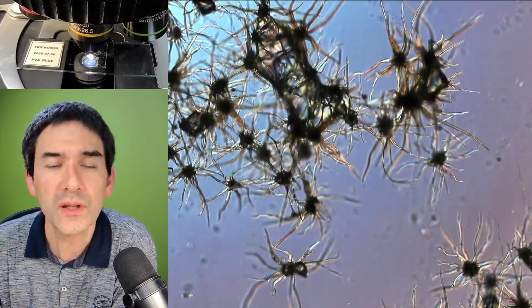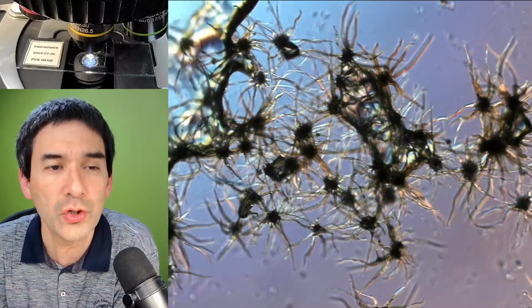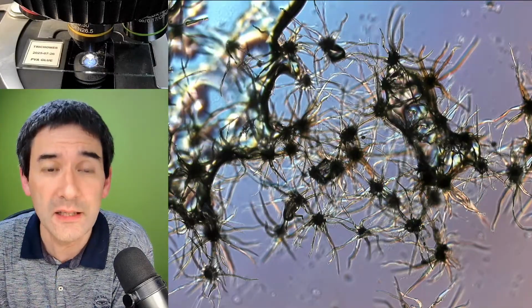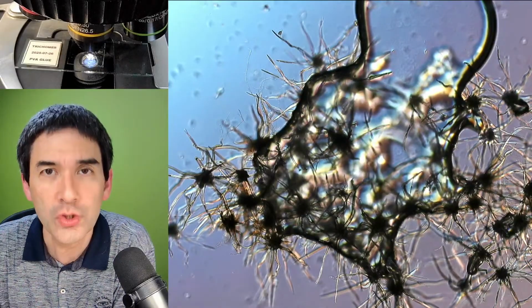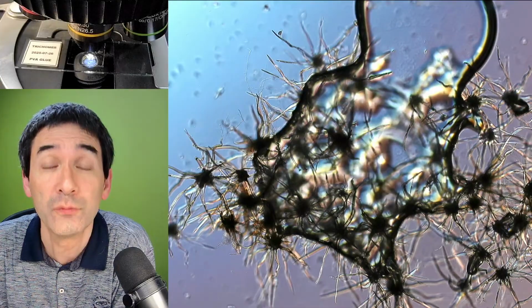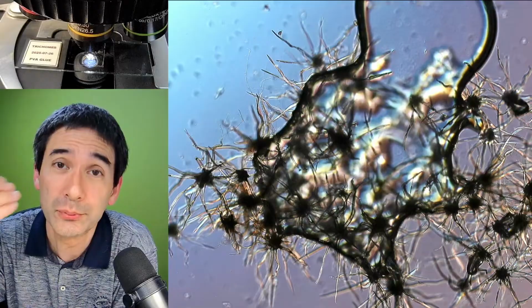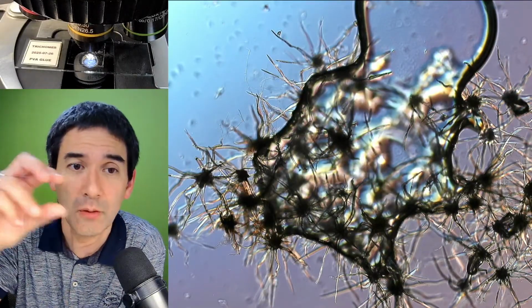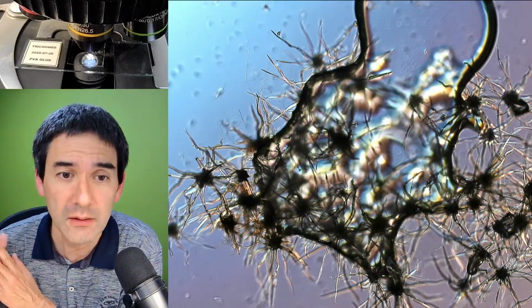Could you please remind us what they are? So yes, those trichomes are hair structures that can be found on the surface of plants, like, for example, this plant leaf, and they have multiple functions. One of the functions is that they protect the plant from insects, because if they're tiny little insects or maybe even mites, they might have a problem actually reaching the cells of the leaf, because there's this fuzzy layer of those trichomes in between, right? So it's a protection, apparently.